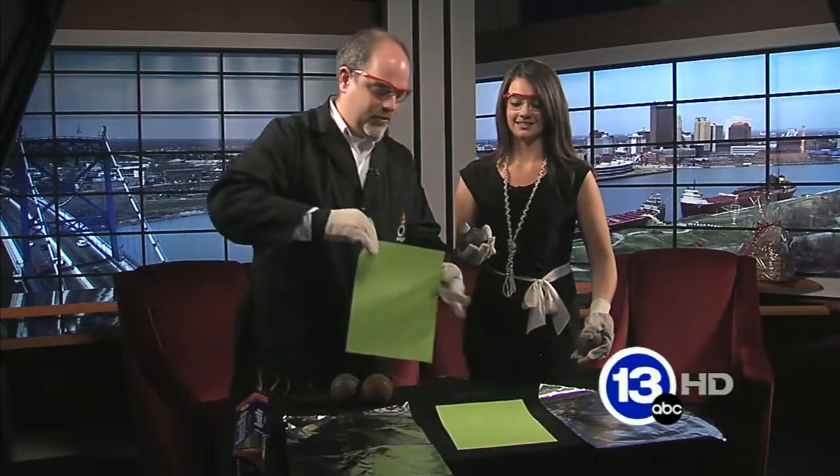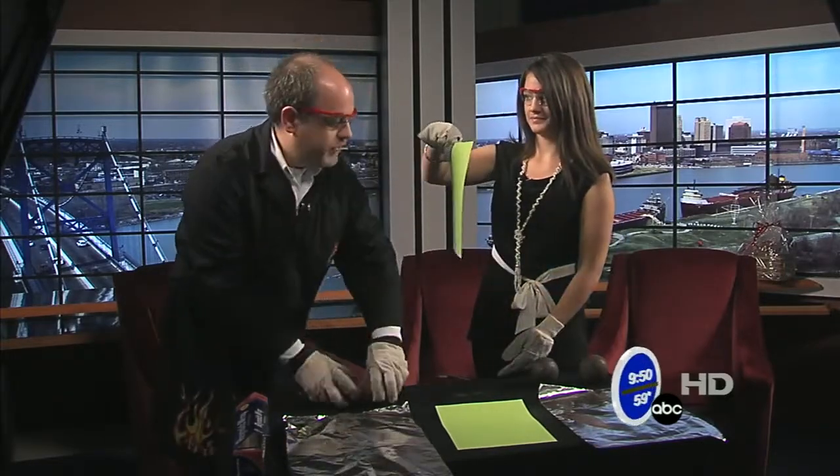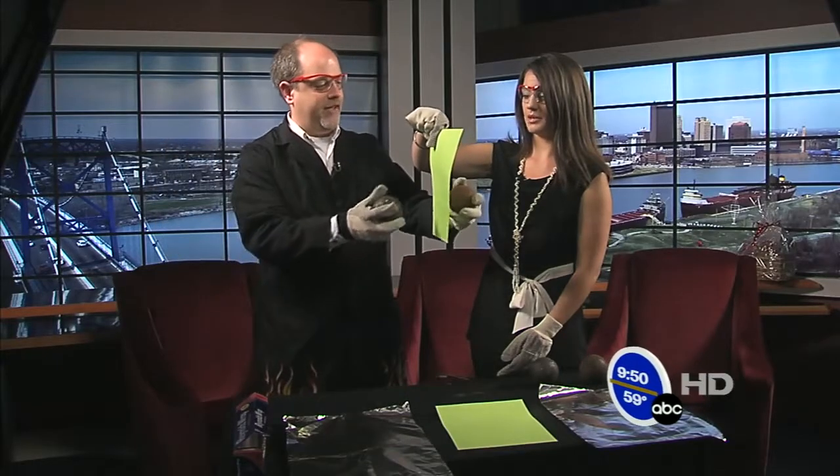I brought with me the very sophisticated tool called a piece of green paper. Can you hold this out in front of you just like that? I'll do the same thing you did with the spheres that I have, and I'm just going to smash them on the paper. I'll try to miss your finger there.